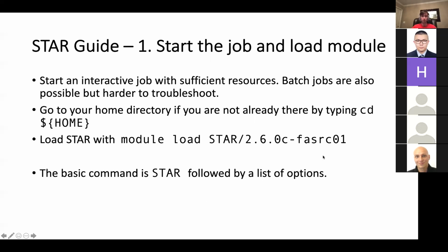Step two, this is all step one. I also make sure that once I'm on the compute node, I go to my home directory. I'll talk a little bit more about this later. But basically, we don't want you writing any files to the stat115 folder. So just make sure you're putting it in your personal directory, and you can go to that by typing cd $HOME.